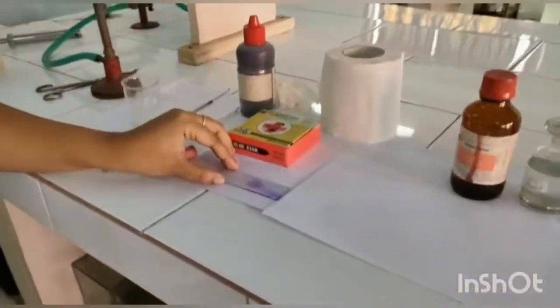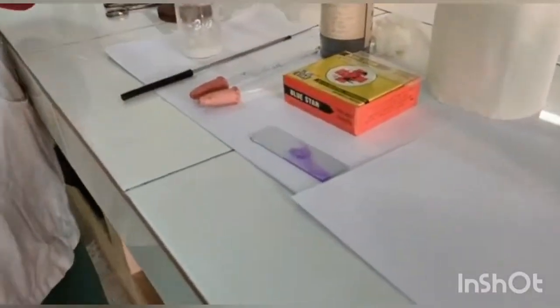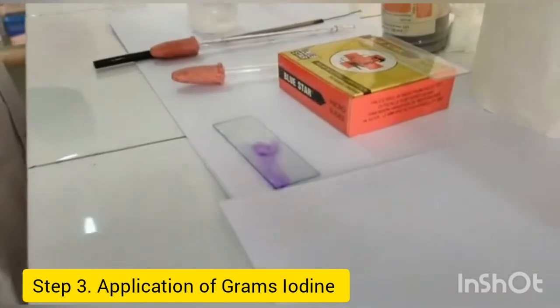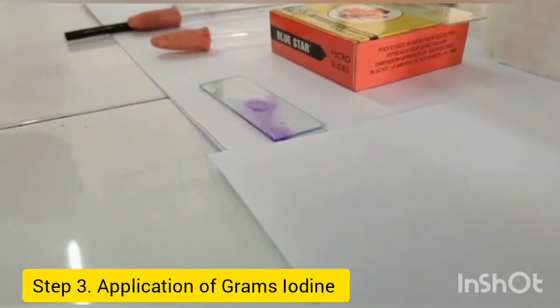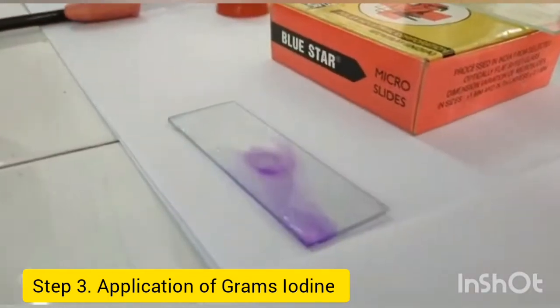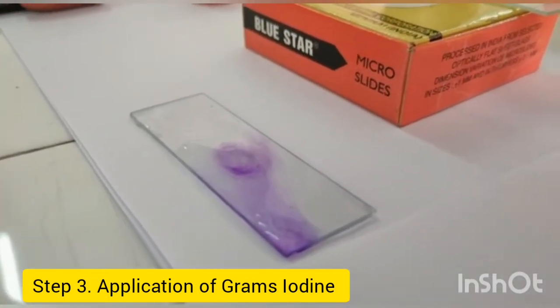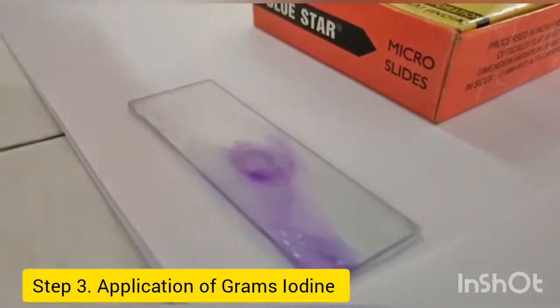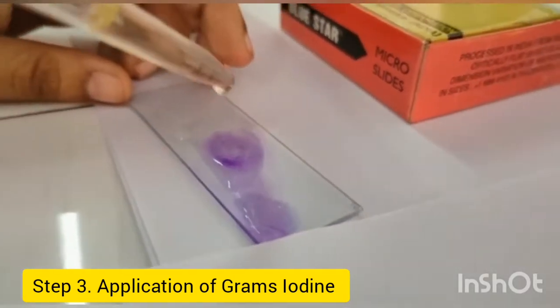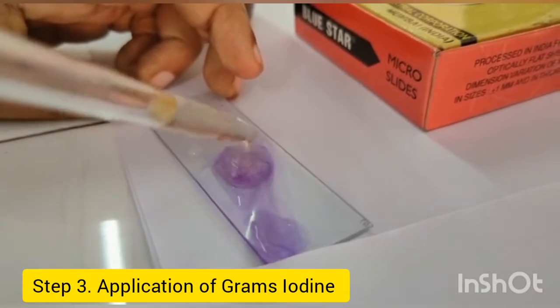The next step is the application of iodine solution. This is the Gram's iodine. Now we'll apply the Gram's iodine over the smear.